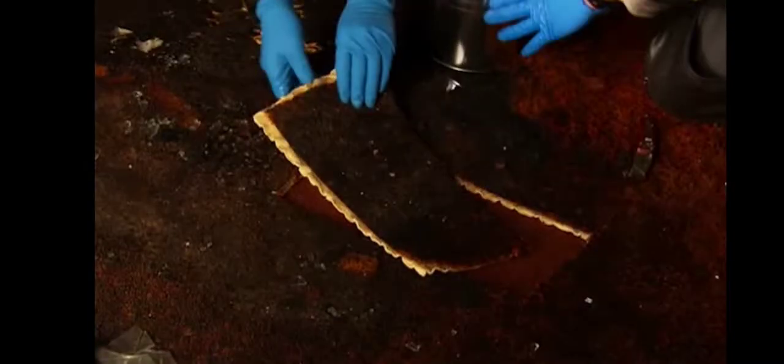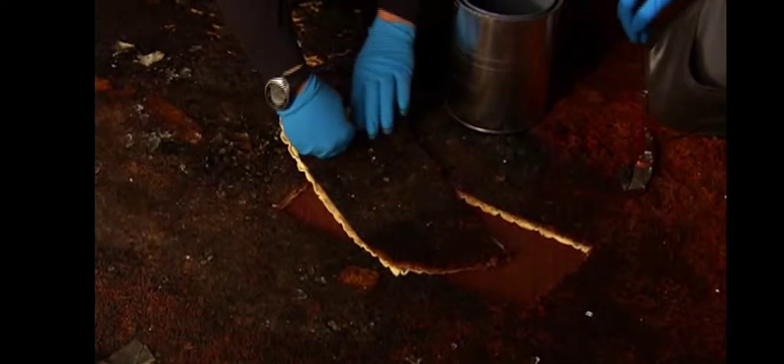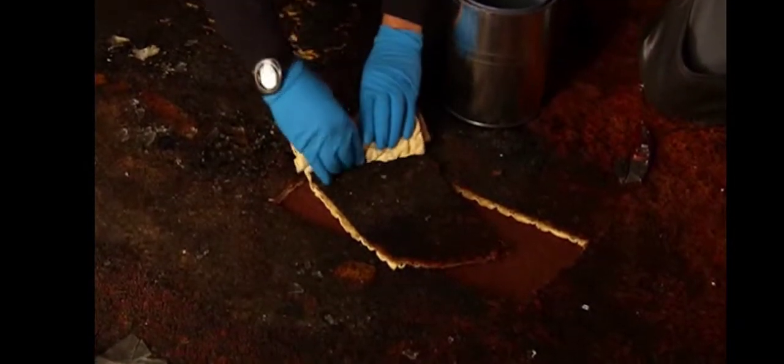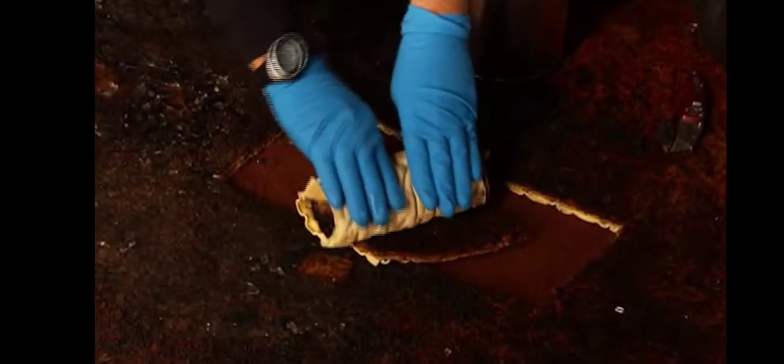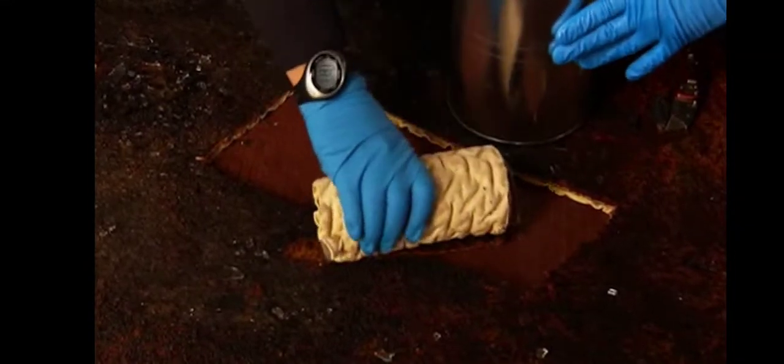I think that carpet is a very good example of this. When carpet is burned, the pyrolysis products that come off of that carpet will obscure a lot of the pattern that we're looking at, and it makes it very difficult to figure out if those products are coming from the heating or the burning of the materials, or if they're coming from something that was added to the sample.